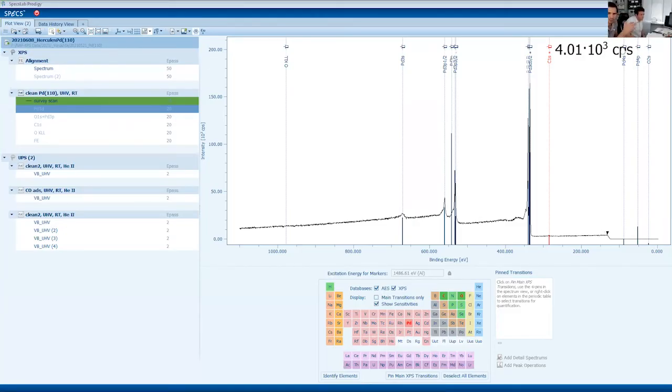You can extract them in the software, but usually one scan is quite noisy, so it's difficult to save one scan. But you can make a sum averaging of every 1, 2, 3 scans or something, and compare this. If you want to see some dynamics, this is actually also very useful. Oh, there is one more point for the group measurement, which I already switched there.